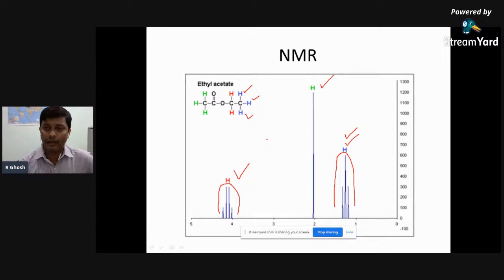So it means that the molecule in the methanol extract which is showing the promising antibacterial activity has been fractionated and collected in the form of the fourth fraction. If that fraction is a mixture of components, then we have to find them out one by one. We have to purify this with the help of a column. Also, we can do the purification.